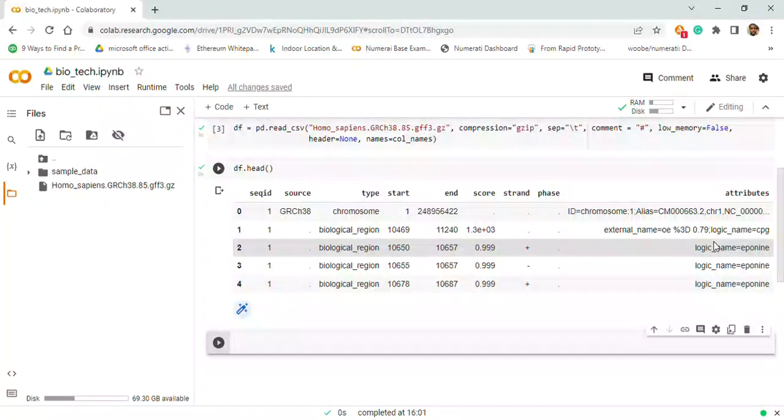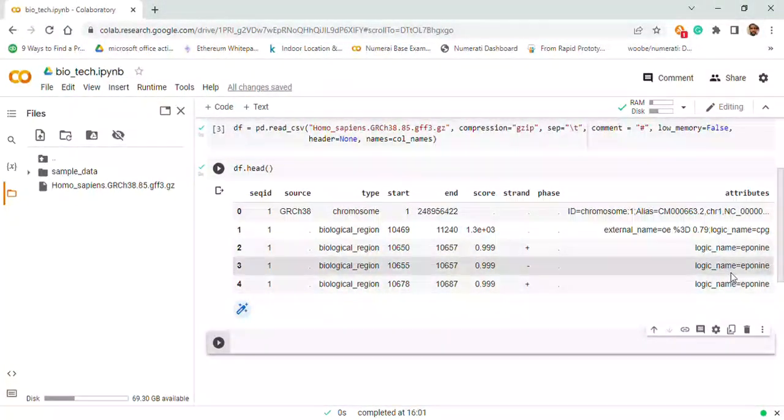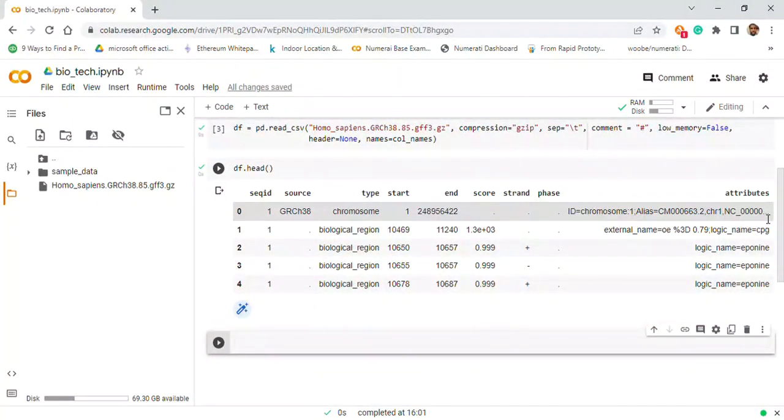But you see here now, there are some parts of this file that are not showing very well. So we want Python, our pandas, to display the dotted parts. For example, you see here there are dotted parts. So we want it to show very well.